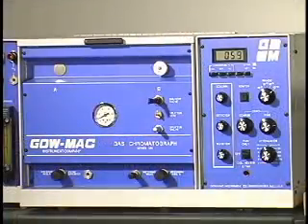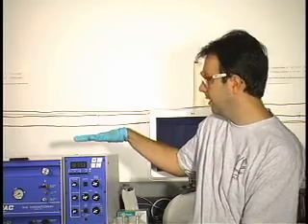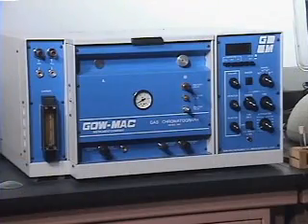So this week in lab, you will be learning how to use an instrument called the gas chromatograph, or GC for short, and the instrument is located right here. I'm going to show you the procedure for injecting your sample into the gas chromatograph.